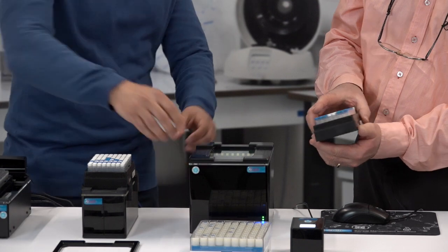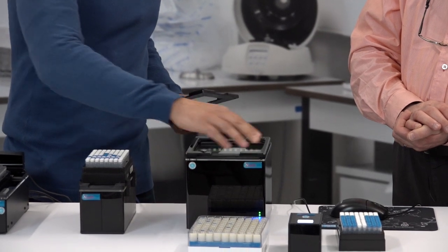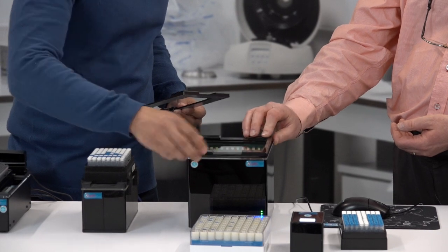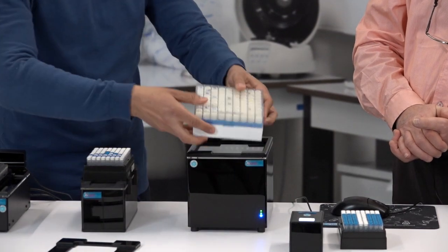Perhaps I can show you how that works. If I lift up like so, they simply click down, and you can place the individual mask onto the pins — it just locates onto these pins and clicks into place. Then the cryo rack goes straight on, like so.